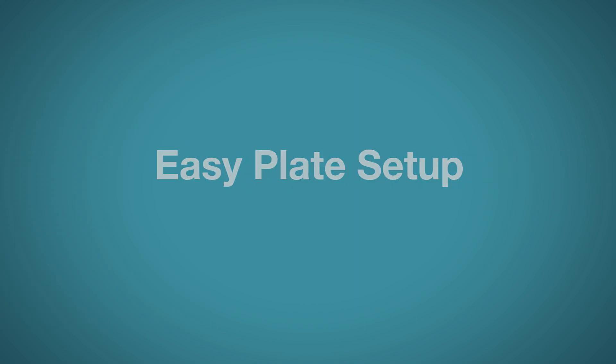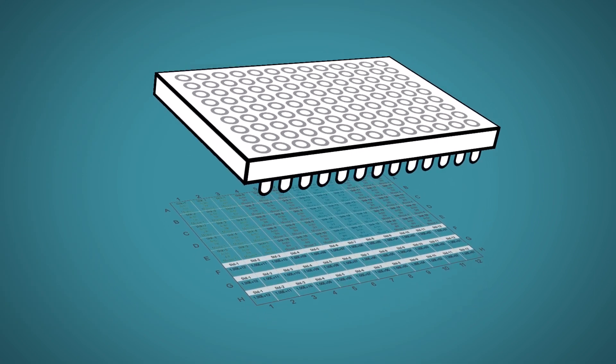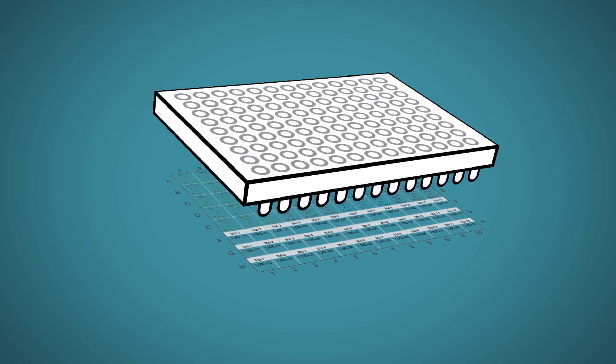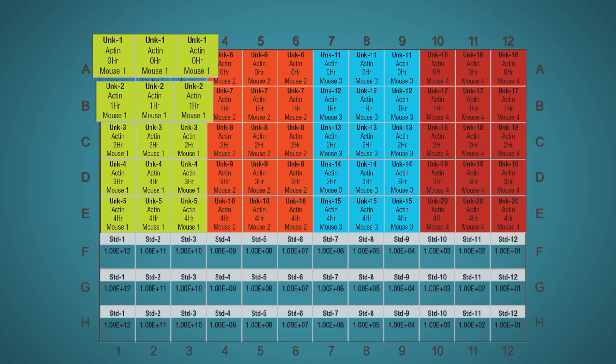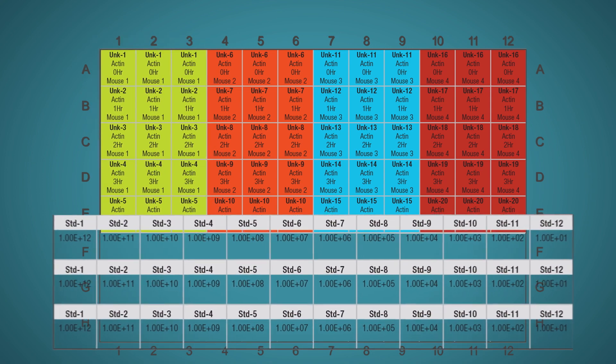You need easy plate setup, so we designed CFX Maestro to have a simple visual interface that lets you quickly create biological replicates, technical replicates, and set up standard curves.